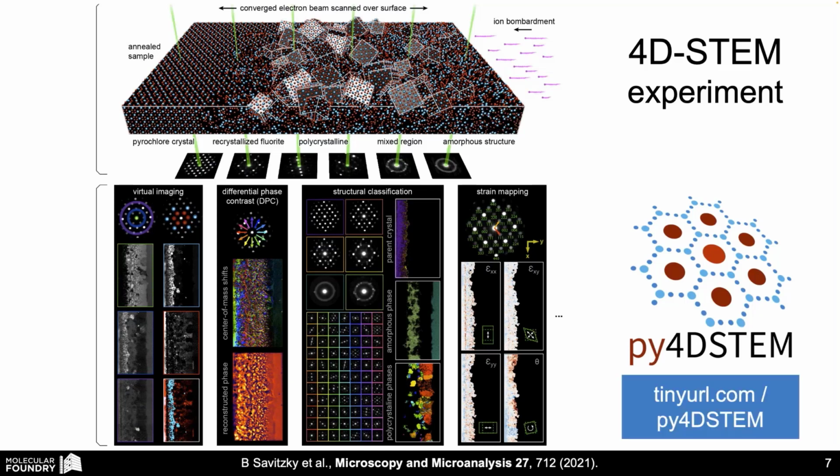I just want to briefly throw up this website, tinyurl.com/py4dstem. This has some Google Colab examples. If anybody wants to check out these measurements here, you can run them in your browser without needing to download any code or any data sets.